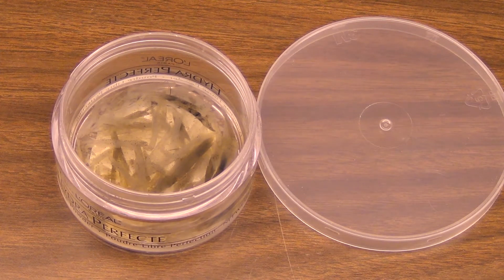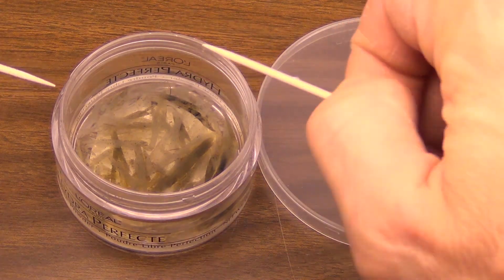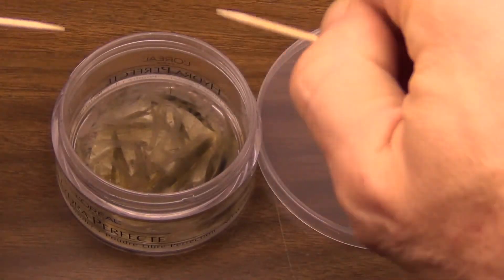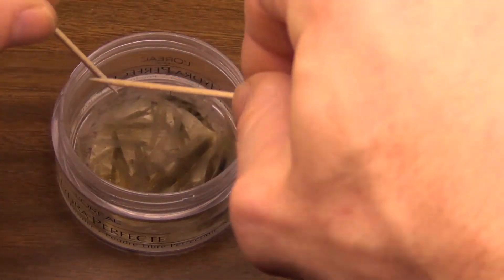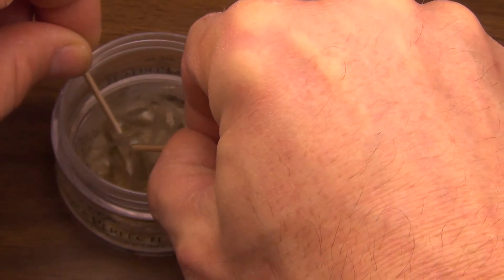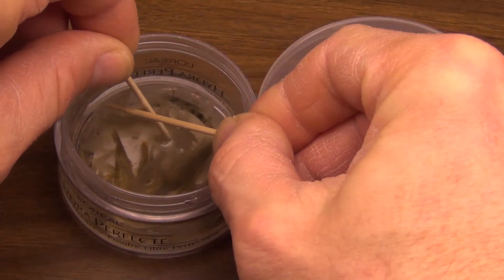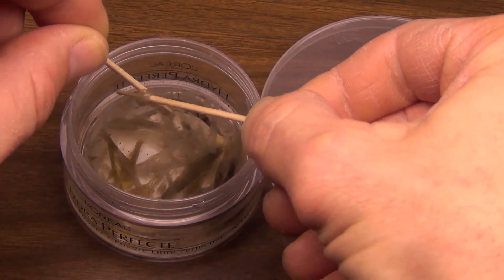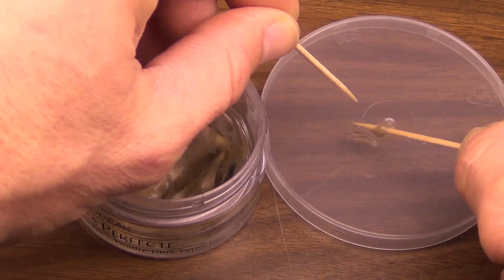I'm going to try to grab some of the slimy bacteria here — white bacteria, iron bacteria. I'm going to get down here and use two toothpicks to try to grab a sample, but it isn't that easy. It just keeps slipping right off. Got one — I got luckier than I thought.